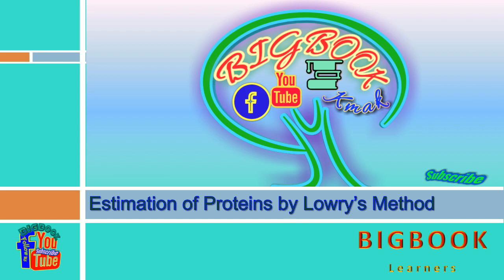In these slides we are going to discuss the estimation of proteins by Lowry's method.